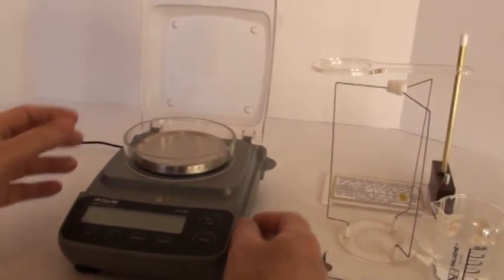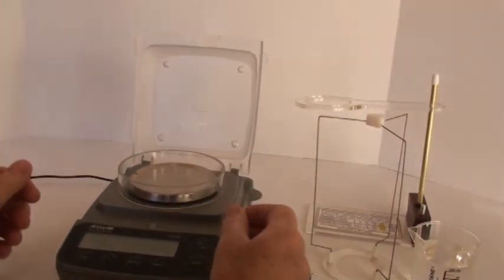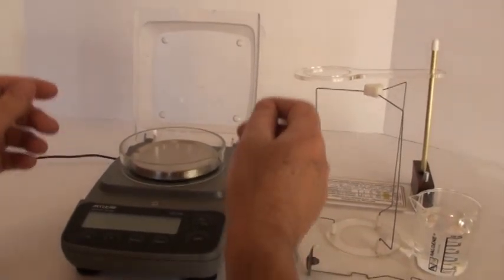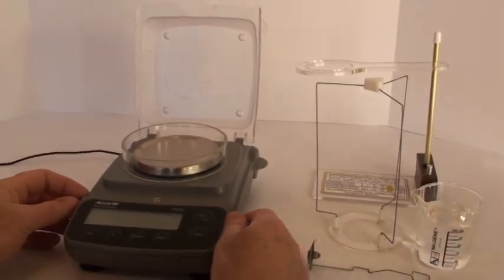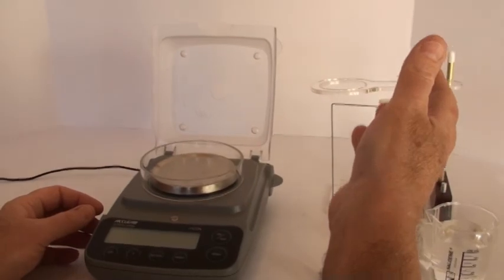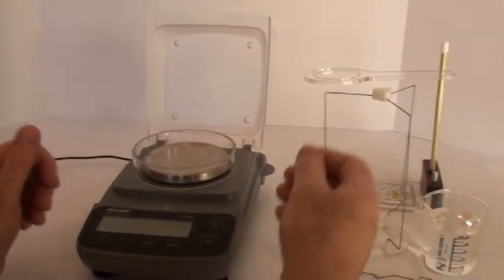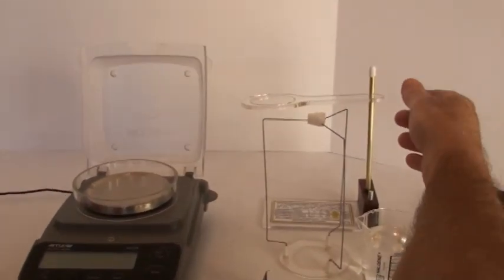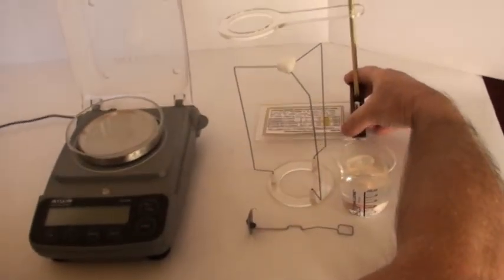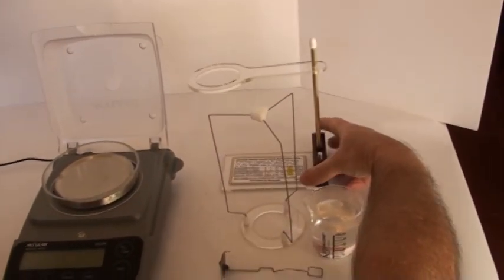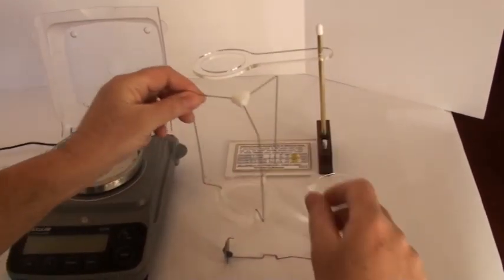Also, if your scale has a draft shield assembly above the platform, you'll need to open one or two doors as needed so that our components fit in place. These are our components over here. This is the beaker holder.